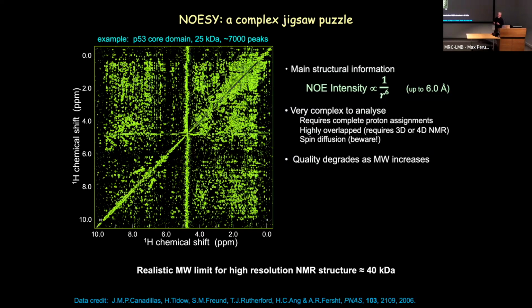It takes an enormous amount of time, and I think it's fair to say in our NMR facility, at the moment, we don't really believe that it's reliably automated. A lot of groups are publishing that they've got reliable ways to automate the picking of this. In this case, this was about 7,000 different peaks that are in there, and they're manually assigned. And this is why the process takes several months to work out. But in the end, what you have is an awful lot of information that tells you what the fold of that protein is.